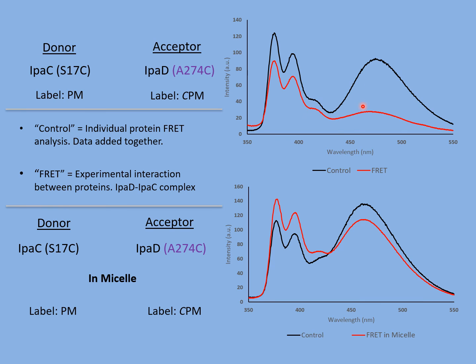So for a positive interaction to be justified, the peak on the acceptor region has to be above the control, and the peak on the donor region has to be below the control. So kind of like this, but not like this. So this right here altogether is a negative interaction, but in the micelle, we see another negative interaction.